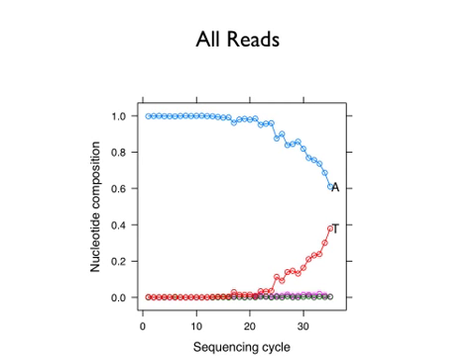There's a few that sort of pop out a little bit. We get an error here and there. So that is in agreement with the very small error rate. It's basically close to 0%. But the T's, after you're past the 20th cycle, look at what happens. You start getting more T's and less A's.